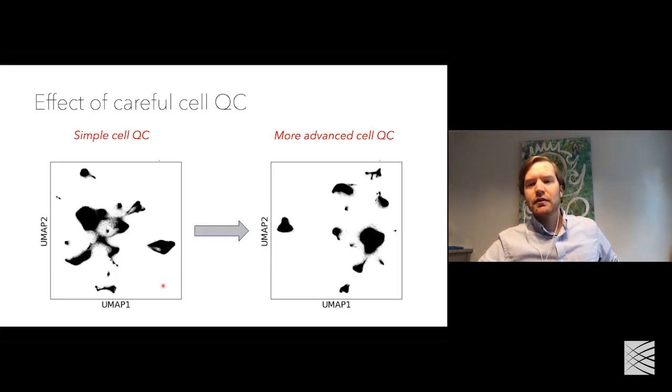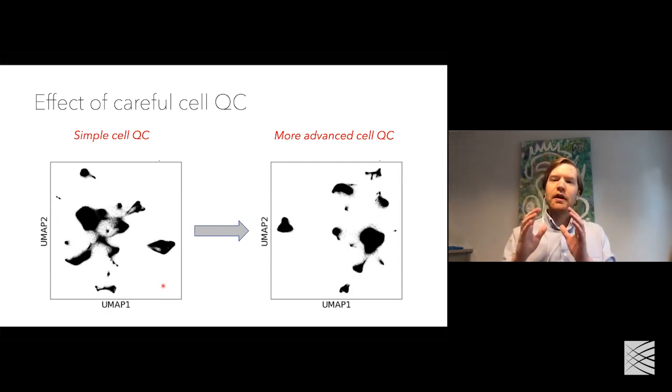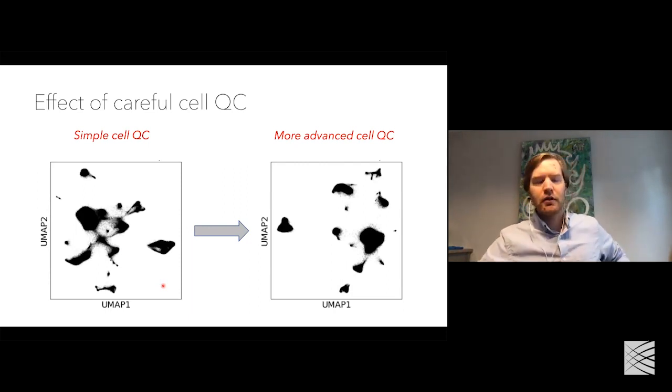Why do we need to quality control cells at all? Well, if we don't throw out anything, you get a lot of empty droplets, you get a lot of dead or dying cells, depending on the experiment. You can get a lot of doublets, where the ideal scenario is to capture 1 cell per droplet, but in reality, sometimes you capture 2 cells per droplet. So you get doublets that look kind of like a smear of the expression of one cell type in another.